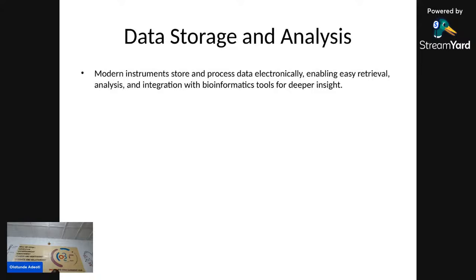Nowadays, whatever training or experience you have, if you don't know how to make use of data, you don't know how to store your data, you don't know how to analyze data, you don't know how to retrieve the data. So that's why we say modern instruments store and process data electronically.